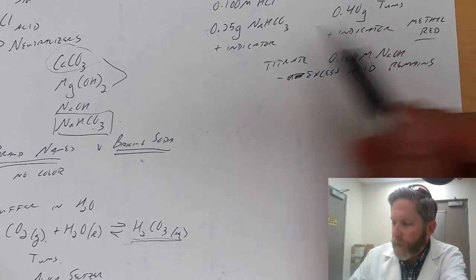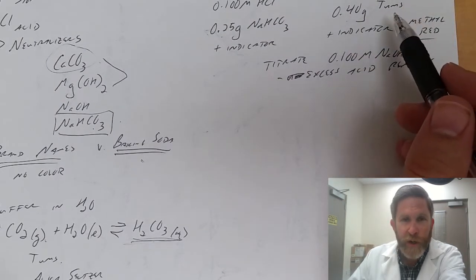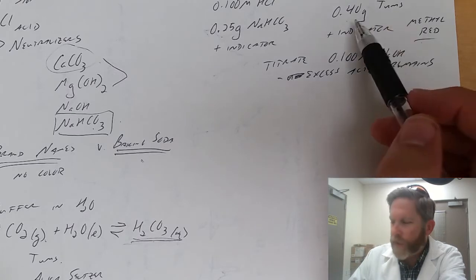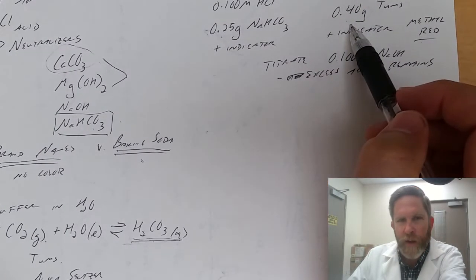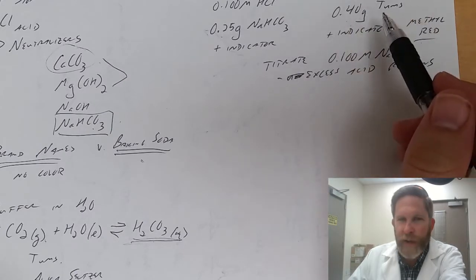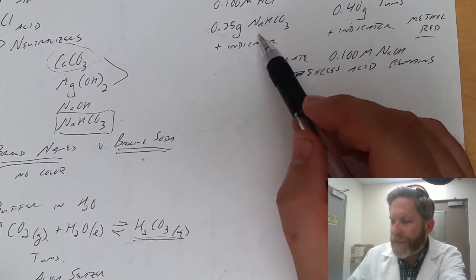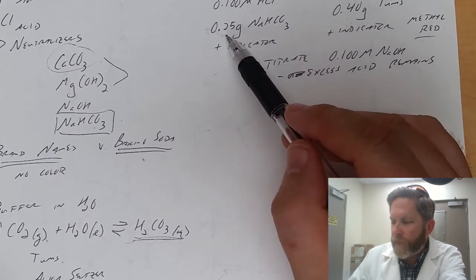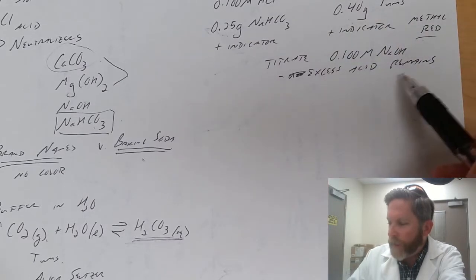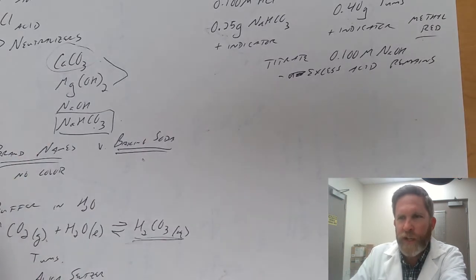So we're going to use fewer grams of this and greater grams of this, again, because the Tums contains inert ingredients, colors, fillers, binding agents. So we found by measuring these before that in order to approximate the same mass of actual neutralizing agent, we need to have a larger amount of starting pill. And you'll find this is true for almost all pills that are sold over the counter. They're not pure substances. So in order to get the same number of moles of neutralizing agent, we need a higher number of grams. And then we're going to compare per gram the neutralization capacity based on which one of these leaves less acid remaining after the neutralization has occurred.